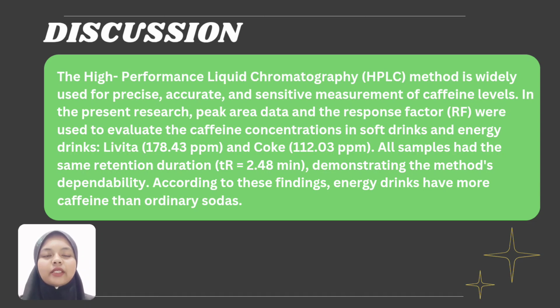Levita had 178.43 ppm and Coke 112.03 ppm. All samples had the same retention duration, which is 2.48 minutes, demonstrating the method's dependability. According to these findings, energy drinks have more caffeine than ordinary sodas.